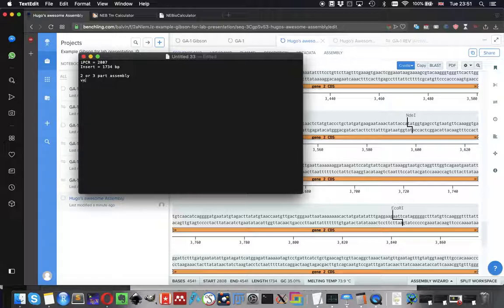you'll need the vector to be around 0.03 picomole to 0.2 picomole, more or less, and that's the amount of moles of that vector that you need. And you're going to need either 50 to 100 ng. Okay, I'm trying to type as quietly as possible, because it makes a lot of noise. So you're going to need sometimes 50 nanograms of that vector.